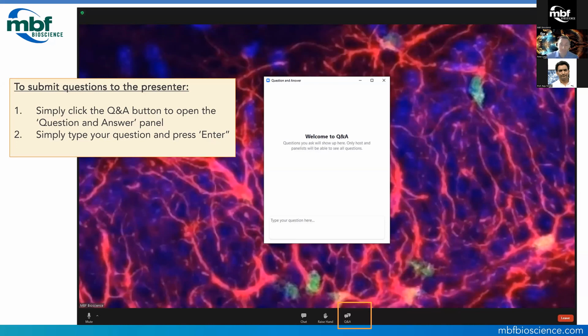In our lab, we regularly use at least two different methods, Clarity and iDisco, simply because these two are complementary in a way. One is very good for antibody labeling, the other is very good for preserving the fluorophore, right? So we generally use Clarity and iDisco, but there are a lot of different methods around, and every few months there's a new method coming up with different properties. So I think it makes sense to spend some time really figuring out which method is best for you.